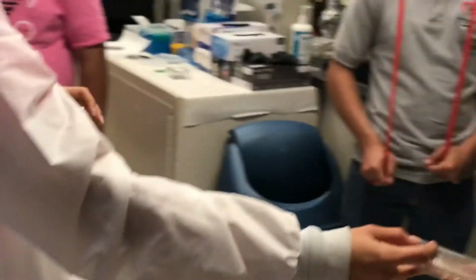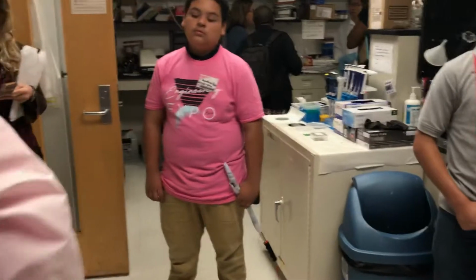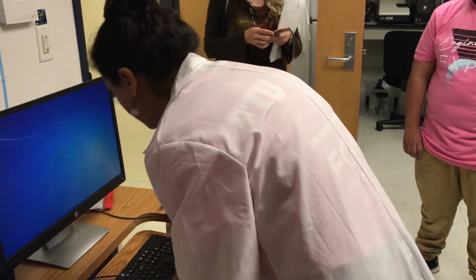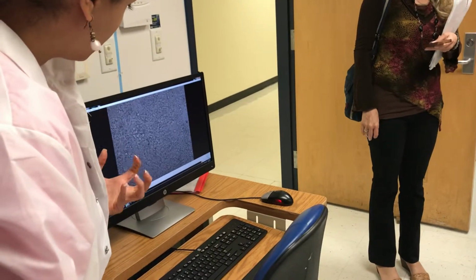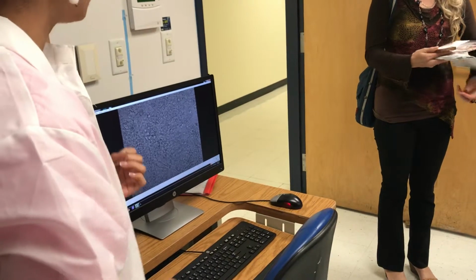Take a look at this around, and then I'm going to show you the cells, how they look under the microscope. So in those things, we will have a layer of cells beating. So this is going to be the layer beating. This is cardiac cells from stem cells acquired. You see how they beat? These are real samples under the microscope.